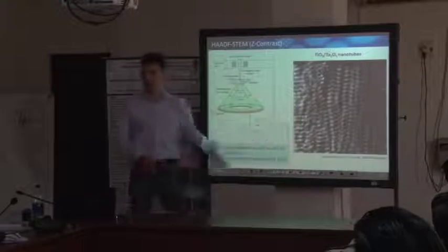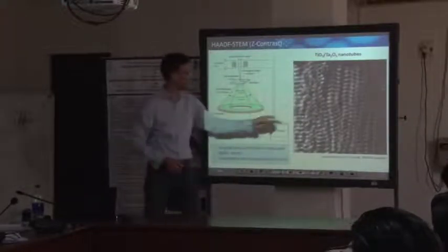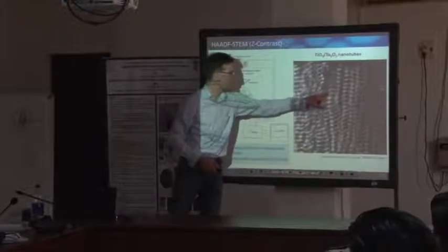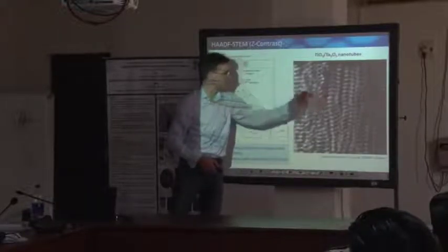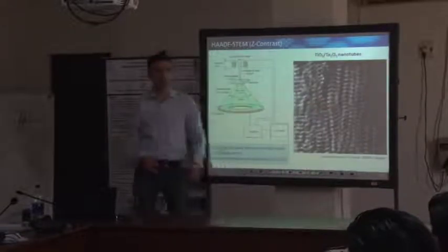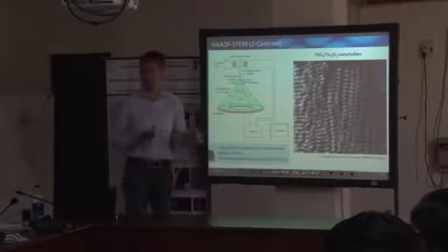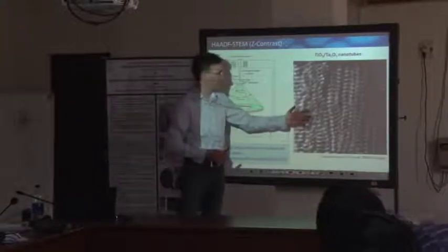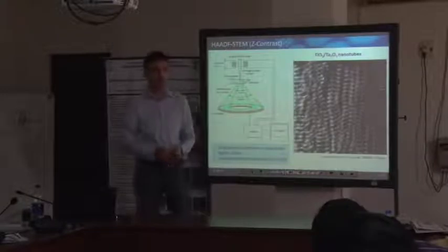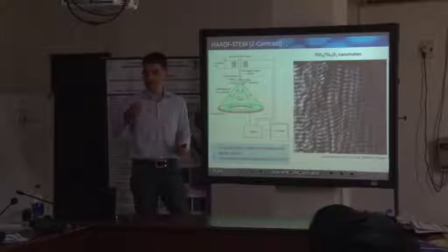In projection, what we see is a certain mass thickness. The thicker the material in this particular region, for this tantalum oxide for instance, the thicker in projection the material is, the higher is the contrast. So there is a certain intuitive interpretation to that. Although we don't go into the details about quantification, in principle, the thicker the material is, up to a certain thickness, your signal will almost linearly increase.